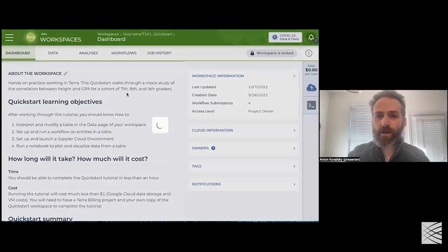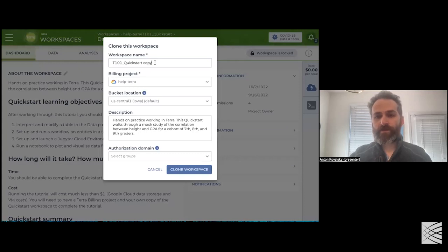So I'm going to do that right now. And I'm going to do it kind of slowly so that everyone has time to follow along with me as I'm doing it. I'll call this MPG demo AK.